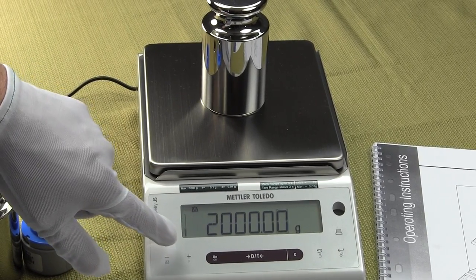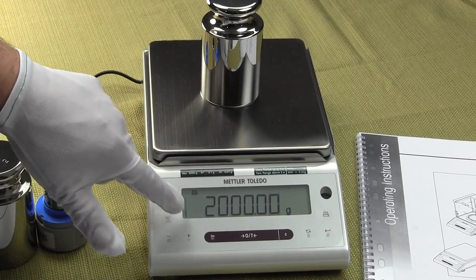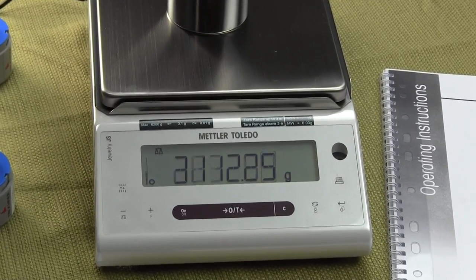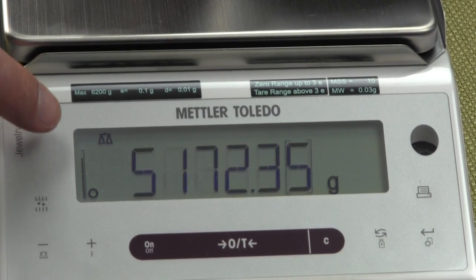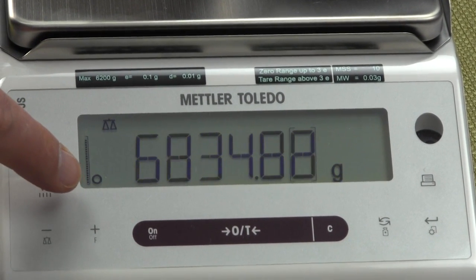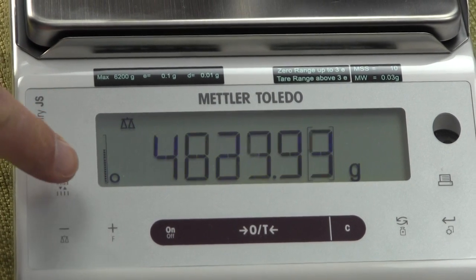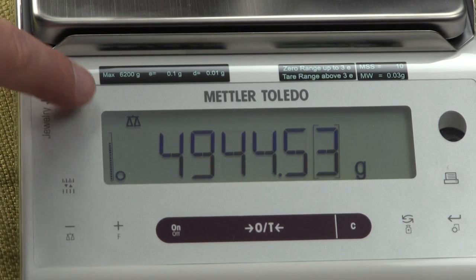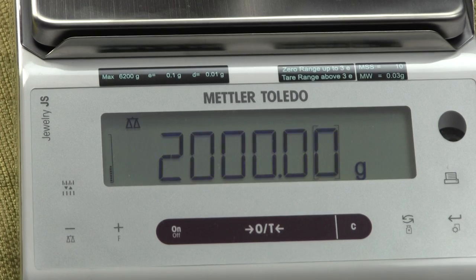You'll notice here on the left-hand column, this is basically a weigh guide giving you some idea of the capacity. So right now we're at 2000.00. And as I put more weight on the balance, you'll see the fill guide go up until when you go over. 6,200 grams is the maximum. It's about 13.4 pounds.